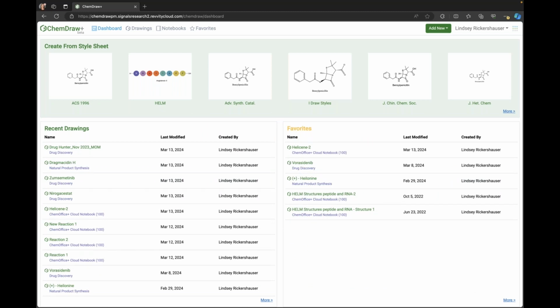You also have access to any of your recent drawings or your favorited drawings. I'll show you in a minute what the favoriting looks like, but suffice to say, these are things that you have probably been working on in the very recent past that you may need to access more regularly.